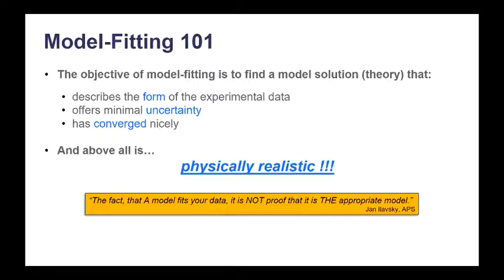That last point is overlooked more often than you might think. There have been many occasions where users have triumphantly sent me tables of parameters from their fitting endeavors, only to have me point out that their dilute dispersion had a volume fraction beyond the close packing limit, or their shell thickness was smaller than a carbon-carbon bond.